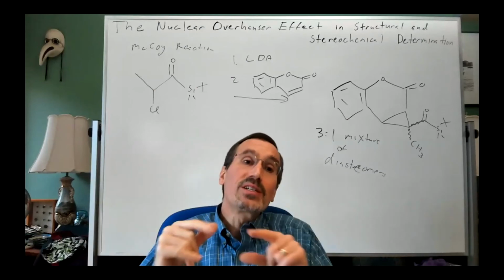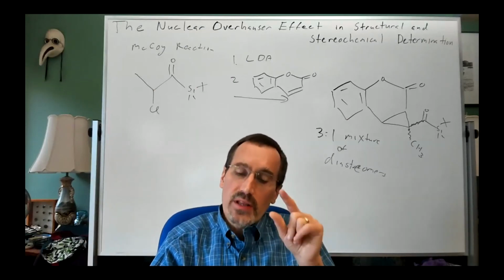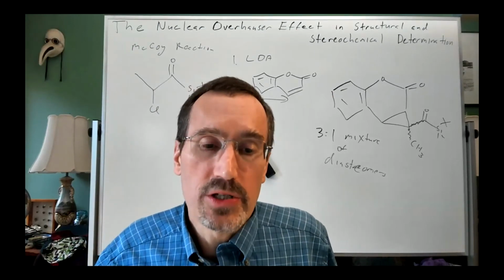Another quick question. So on the spectrum that we just did, you looked at the ortho proton, but why didn't you look at the methyl peaks on the very right? You mean, why did I only show you one NOE experiment? So in the one I did, oh, the methyls, okay. Let's go back to that. Good question.